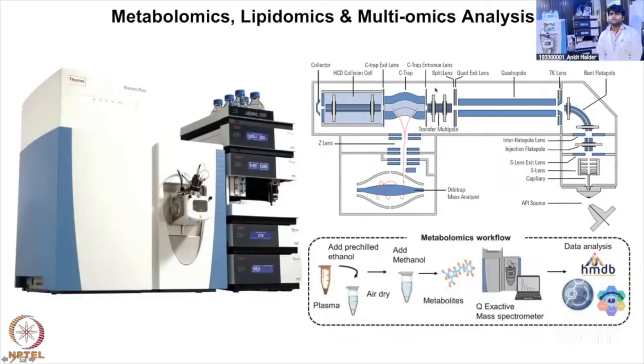One could extract from the protein, one could do the metabolite, one could do lipid, and then try to build the layer-wise information. Of course, people also do genomics on the same sample. So then one could do truly integrated omics, in that way.